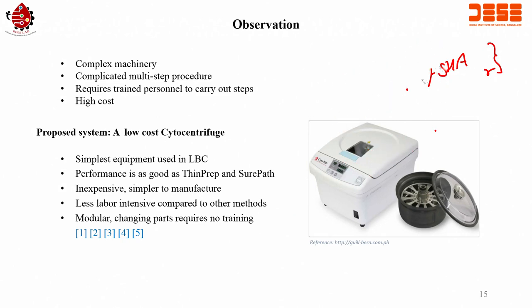So, let us see the proposed system, the one that we are now building, and that is important. It is the simplest equipment that can be used in LBC. Performance should be as good as ThinPrep and SurePath. Inexpensive, simpler to manufacture, less labor intensive, and modular, where changing parts requires no training.